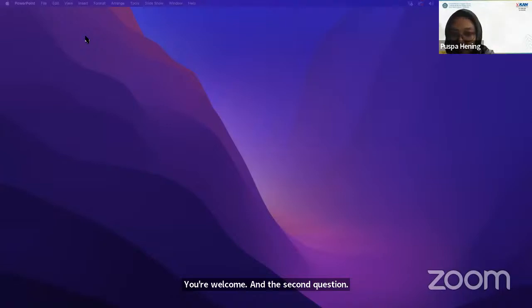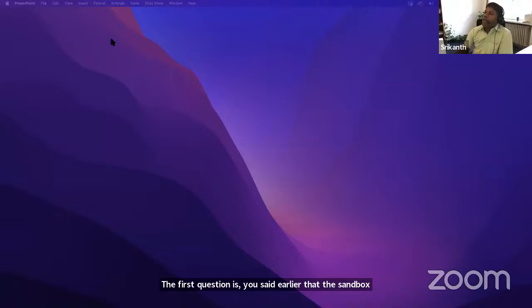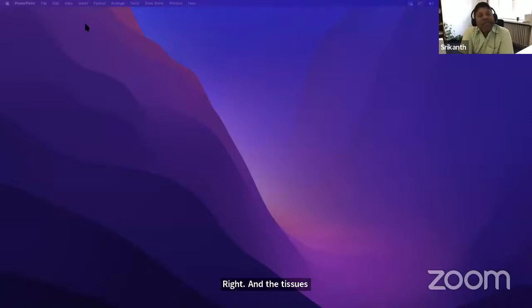Yeah, we have another question from Ariel from the National Research and Innovation Agency. He has three questions, Prof. The first question is, you said earlier that the sample is embedded with resin. How do you make sure what EM observed is the specimen and not the resin? Yeah, it's a very good question, practically. Same thing also when you do a normal paraffin embedded tissue, right? The tissue is there and paraffin is there.